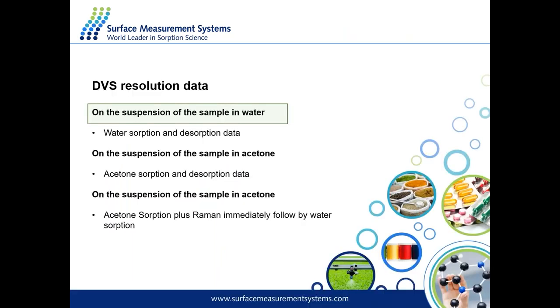The more advanced study that I want to show you today is the formation of a hydrate and a solvate, specifically of carbamazepine. We are doing a study on water absorption for carbamazepine and then acetone absorption. We're going to do a study first with just water, then just acetone, and then we are going to try to generate the hydrate, and try to generate the solvate with acetone and see what happens when we start pushing in water. Is the solvate much more stable than the hydrate, or does it move back to the initial form? So let's start from the first section.